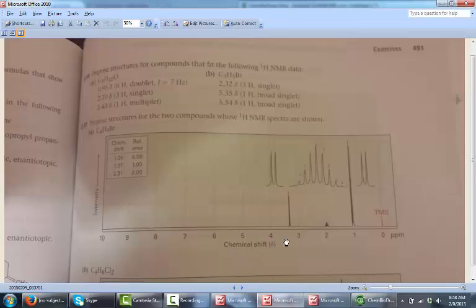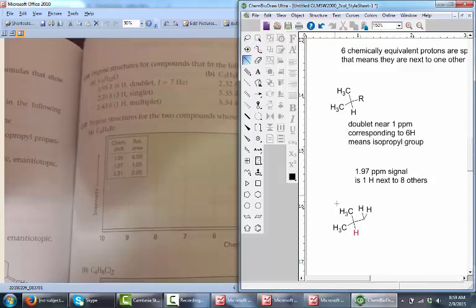And if I look at the signal now at 3.31 ppm, I can see that they are in fact split into a doublet that corresponds to 2. Alright, and now what I'm going to do is just add the bromine at the end over here. And the reason I know that the bromine has to be over there rather than any other place in the molecule is these protons, so let's give them a nice color.